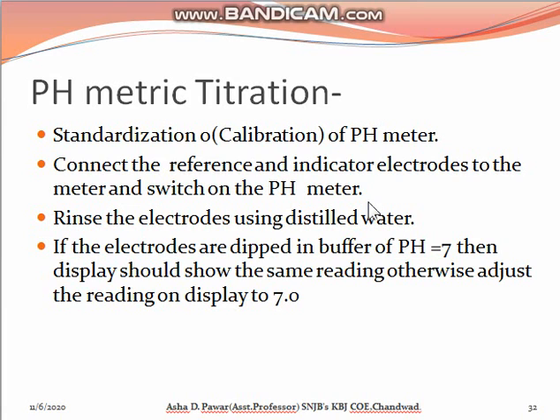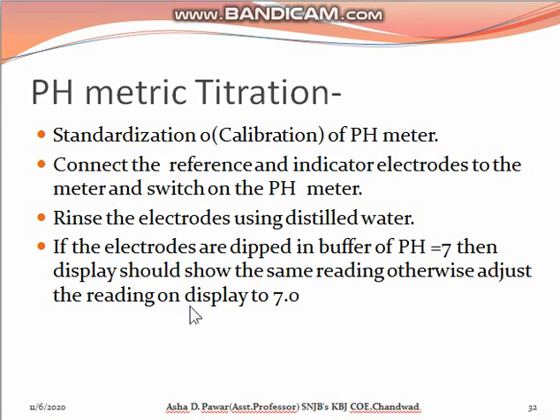Before the pH measurement of the acid-base titration, it is very important to calibrate or standardize the instrument used for the pH measurement, that is the pH meter. Connect the reference electrode, the calomel electrode, and the indicator electrode, the glass electrode, to the pH meter and switch it on. For standardization, we use buffer solution of either pH 7 or pH 4. Before dipping the electrode, rinse or wash it with distilled water. Dip the electrode in pH 7 buffer solution; the display should show the same reading, otherwise adjust using the adjustable key. Keep the temperature key at 25°C and with the standardized key, make the display show a reading of 7.